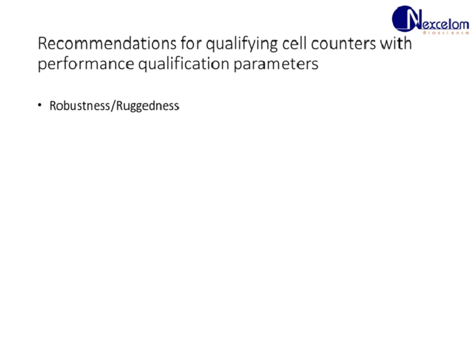This is where your cell sample, when you introduce non-specific particles, for example, if you have PBMCs or if you have Jurkat cells, if you introduce beads or red blood cells, that should not affect your cell counting results. So that's one way to look at robustness and ruggedness.